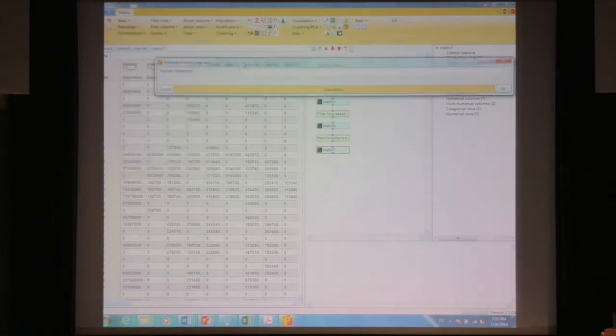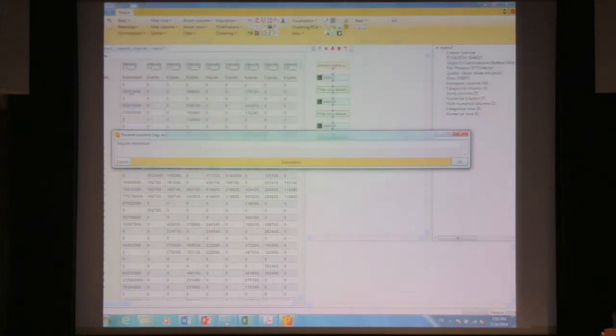And if we type in here the string which is repeating, in this case it's Intensity dot star, intensity space, and then in the brackets dot star.